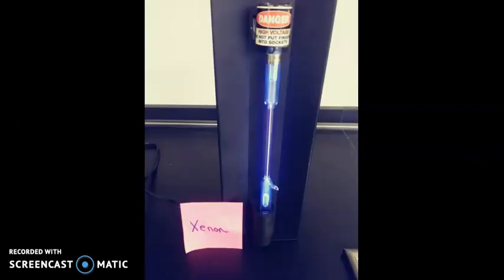Here's xenon. We're just marching down the noble gases at this point. So now xenon has a full shell extra electron. Naked eye color, we're seeing that kind of beautiful blue color. Here it is through C spectra paper. I just wanted to show you how the image is actually changing.